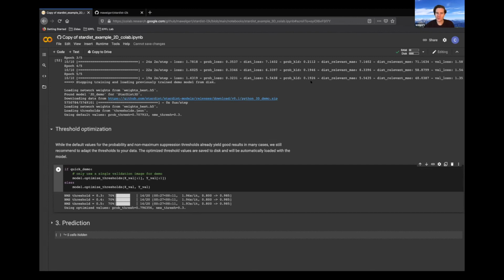And these are just the defaults. We will later see in the prediction scripts and in Fiji, you can manually do that to your liking, but this is just the default that it will pre-calculate, which makes sense on average, right? There was a question? No. Okay.